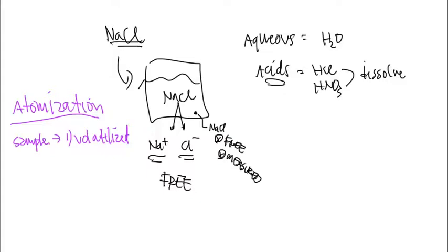If I use acid, the acid has to be gone. I have to go down to the actual components that I want to measure. And number two, we're going to say decomposed to produce an atomic gas. All right, that's the process of atomization.